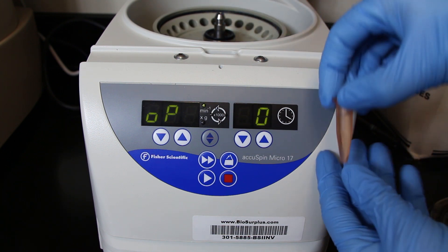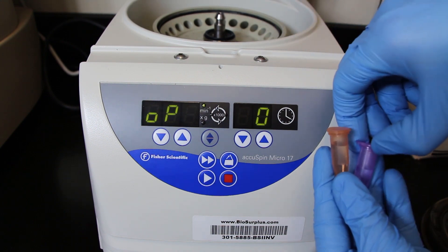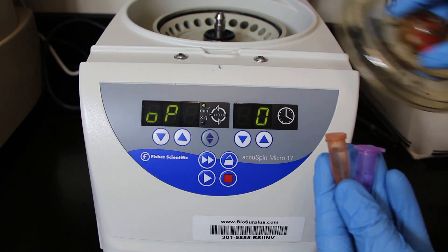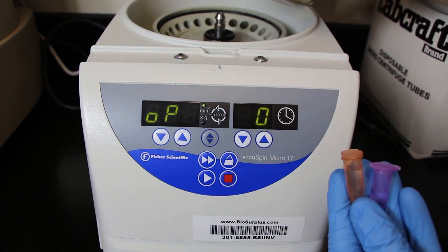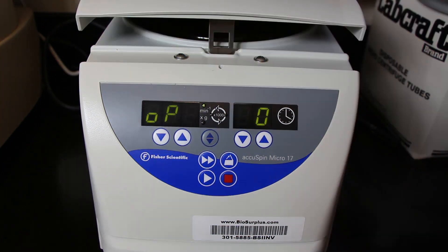If you're going to run another sample, just restart the process. If not, leave the centrifuge lid open, but make sure you put the plastic disc back in first, and then just flip the switch on the back of the device to turn it off. That's a quick overview on how to use this particular microcentrifuge, which is very simple to use. If you have any questions, put those in the comment section below and I'll try to get back to you. Otherwise, please come back and watch another video. Thanks.